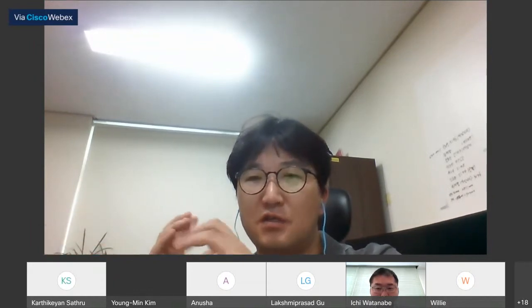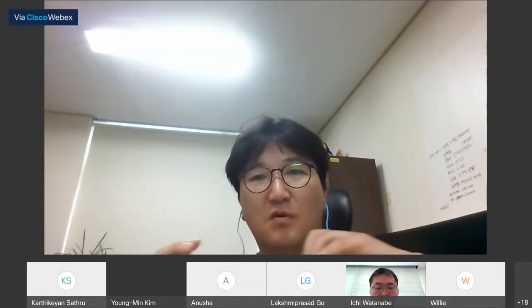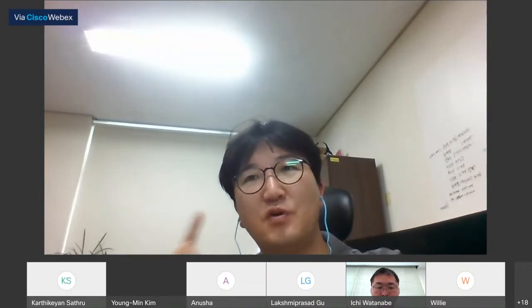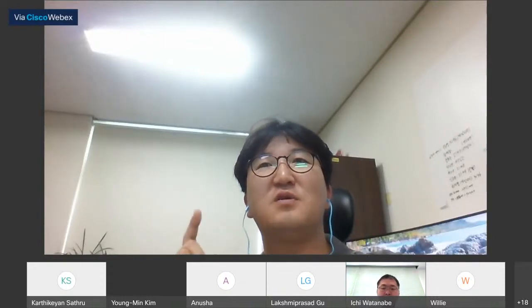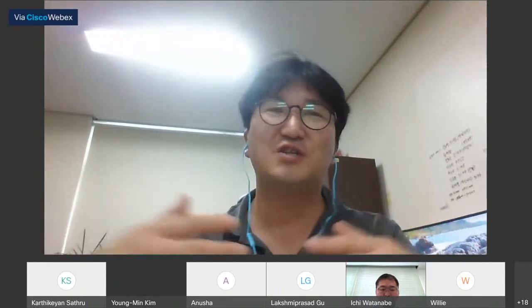And also, I think Ichi-san can provide some application notes, because the Frontier Lab USA team also designed good systems. We can operate all detectors at the same time using three-way splitting systems, so we have some kinds of application. Also, the important thing is that the operator has to prepare the standards. Otherwise, you cannot calculate the carbon yield. This is the most important, however, very difficult step. In my case, I don't have enough money to purchase all of the oxygen-containing products. So I calculated the yield of BTX and other polyaromatic hydrocarbons, the light hydrocarbons, and CO and CO2. For products like phenol and acetic acid, I didn't calculate the yield.